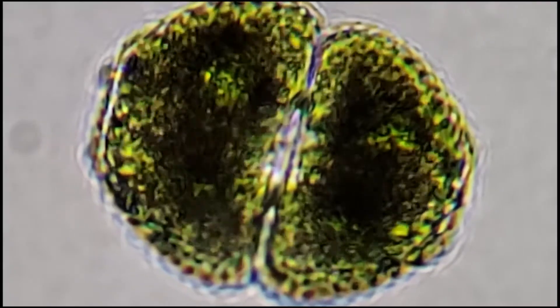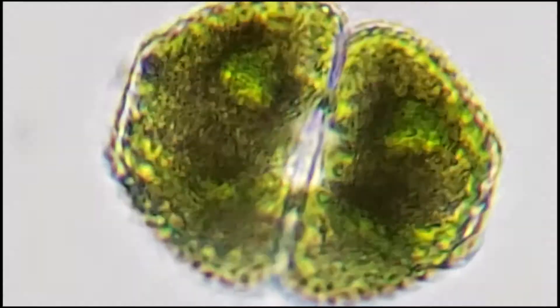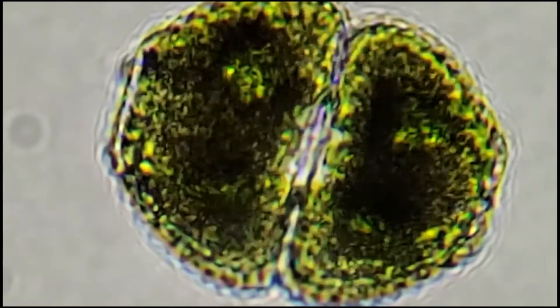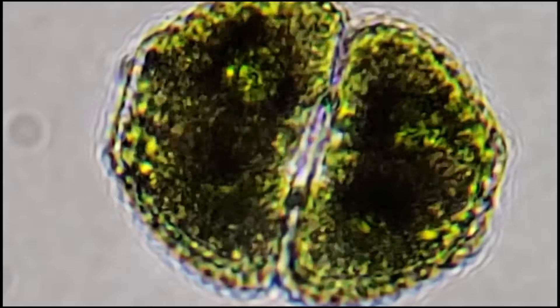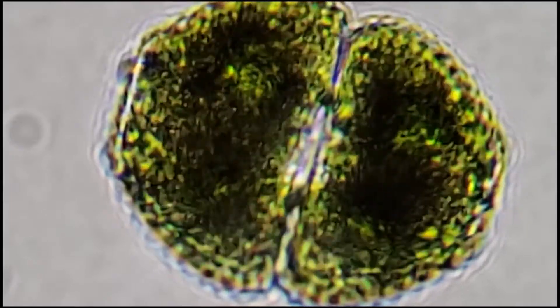I've always liked Cosmerium. Its simplicity and symmetry has always intrigued me. In fact, the entire group of single-celled algae known as the Desmids have a wonderful array of shapes and symmetries. But I was especially interested one day when I zoomed in on this particular specimen and saw a mystery beyond its appearance.